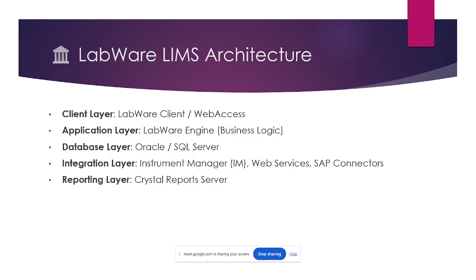Coming to the LabWare LIMS architecture, if you want to create any LIMS architecture, I am majorly explaining the web-based one. In the web-based architecture, we require servers, databases, some schedulers, and admin clients for the creation of the LIMS architecture.